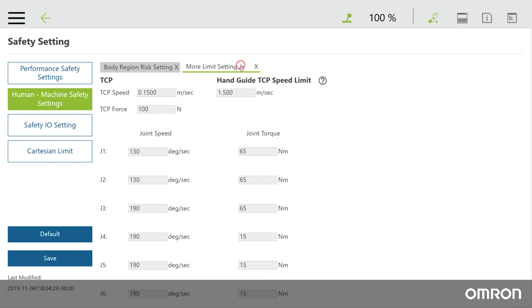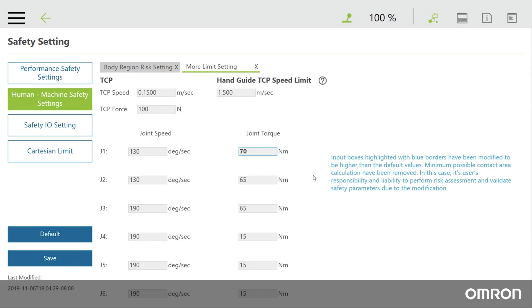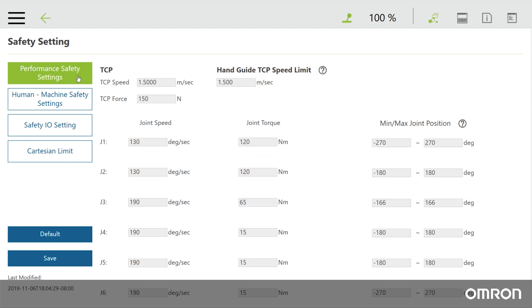You can adjust additional parameters to set up safety limits. If the user sets the safety parameter to be higher than the default, a pop-up warning will appear and those values will be highlighted. We recommend conducting a risk assessment if you'd like to proceed with higher values. Meanwhile, the performance safety settings are used when you want the OMRON TM robot to be operating at the fastest speed possible to reach a certain cycle time. These settings have higher TCP speed and force limits, and it is assumed that no person can come in contact with the robot.